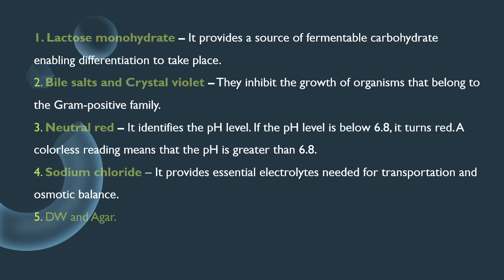These are very important ingredients. The role of lactose monohydrate is that it provides a source of fermentable carbohydrate, enabling the differentiation to take place.